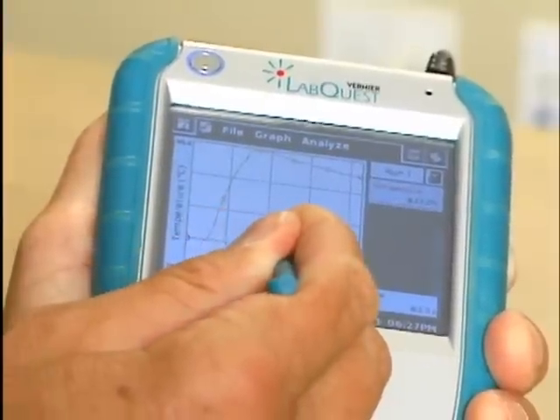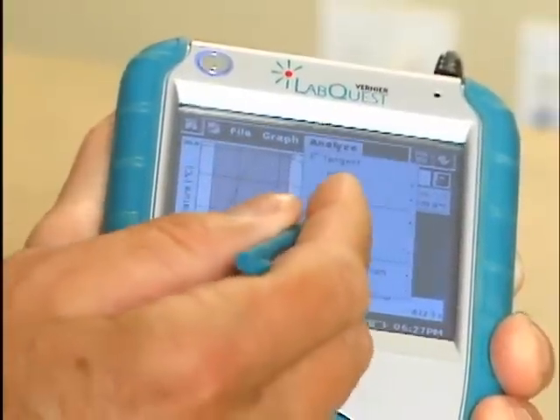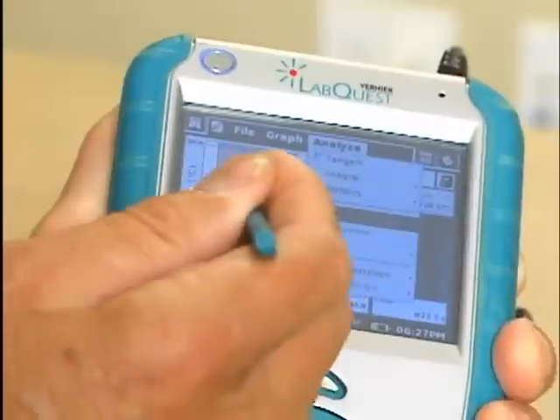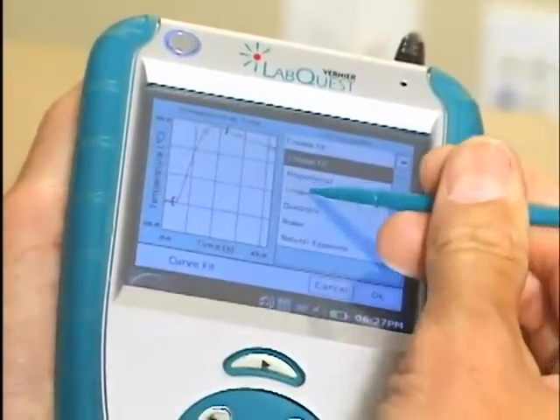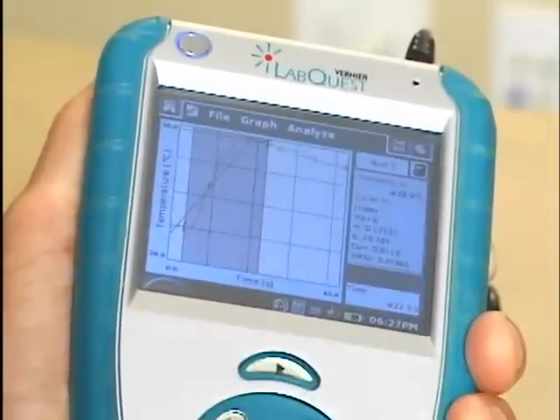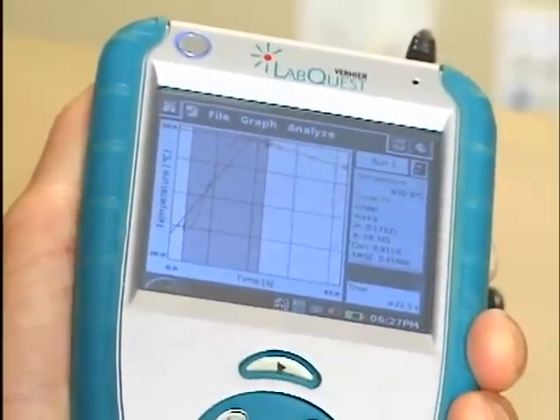Now we have our data. You can select a region here — you may want to analyze that region, so you can go in here and do a curve fit on our temperature data. From this fit you can choose a linear fit, and it performs the fit and shows it on the graph along with statistics of the fit off to the right.